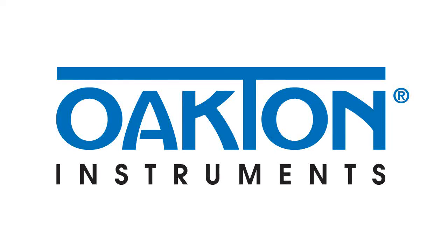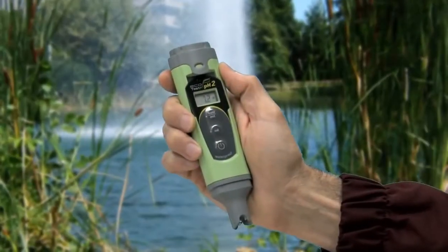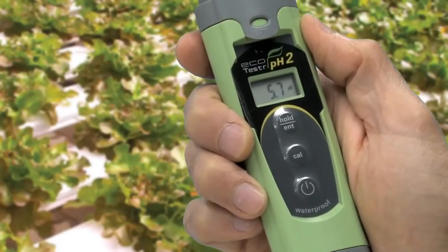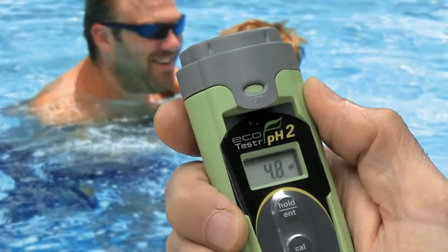Setting the standard once again, Oakton offers a low-cost pocket pH meter that is a great choice for hydroponics, pool and spa, and education.